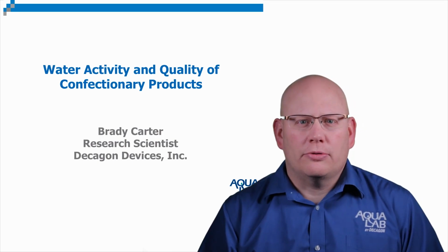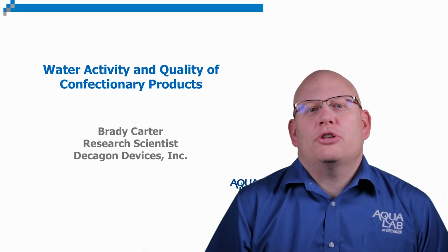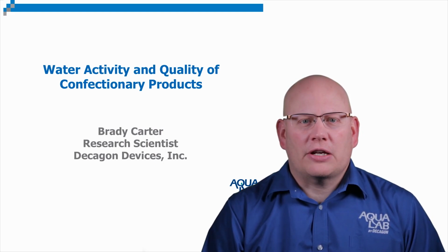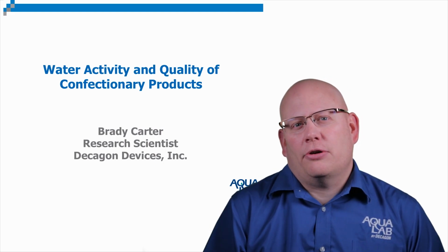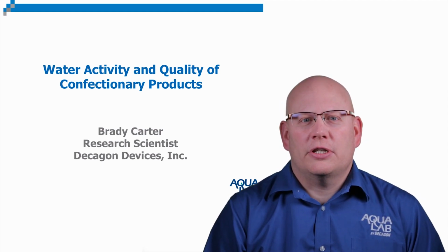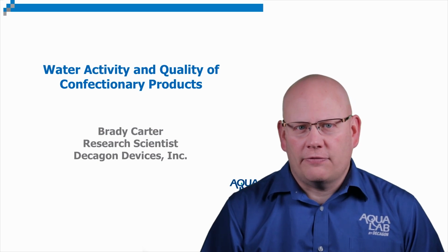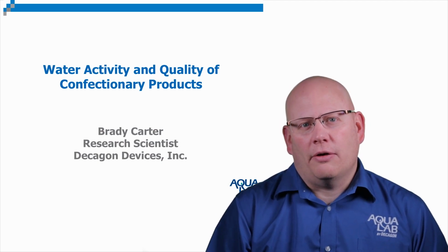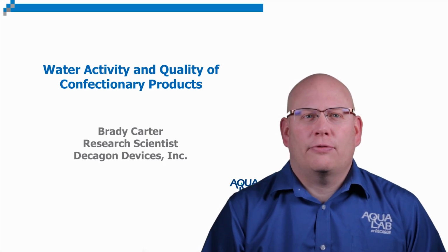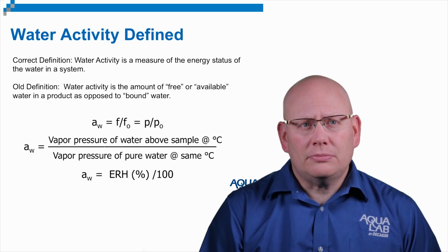Today I hope to be able to explain additional information about how water activity can be helpful when making confectionery products specific to those confectionery products. And this is part of a group of virtual seminars where we try to focus in on specific applications and provide information that is very detailed for that particular application. And so today this is for confectionery products.